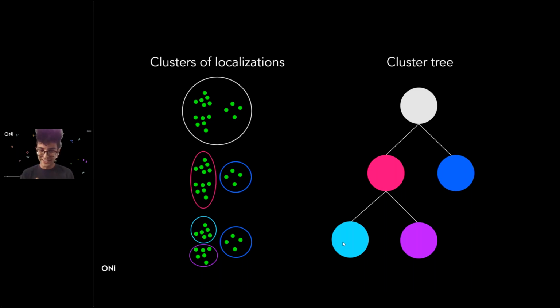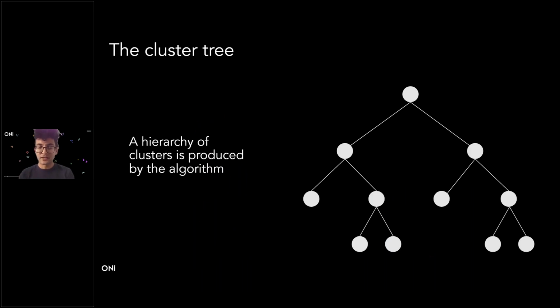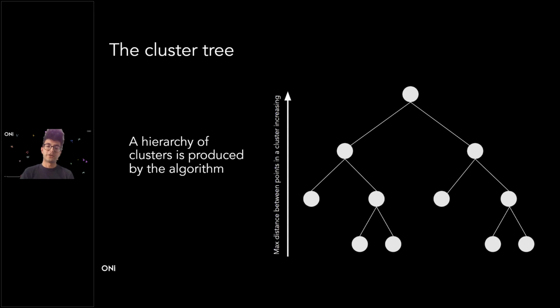Okay, so hopefully that's a clear enough explanation of how the cluster tree is formed. Let's now look at a slightly bigger cluster tree to talk about the algorithms that we actually use in our analysis software. So our points go into the clustering algorithm. They derive this cluster tree. We're not going to go into the maths of that in this webinar, but feel free to reach out and contact us if you want to know more about it. And then once we've got this cluster tree, there are many things we can do.